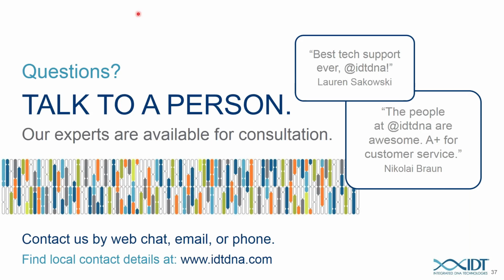Okay. This is a good question too. What is the impact of the cell doubling time on RNP efficiency, and does it still work with cells that have a week of doubling time? Man, that's just something I don't think we've looked at. That's a good question. I can say that RNP delivery is more finicky, especially with lipofection. You need to take cells that are not fully confluent yet and that sort of thing. But we really haven't done a careful analysis of cell doubling time and editing efficiency.